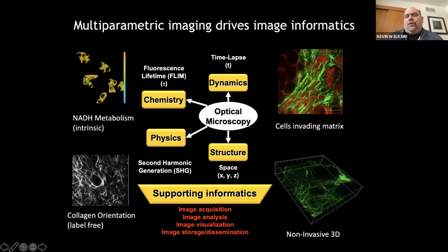As someone who's been building optics for about 25 years now, I've seen the evolution of my lab. It used to be that when we built a microscope, the challenges were often purely physical science and optics, but now a lot of the challenges really are computational. They don't always get highlighted as much as they should. And many of the images we collect, you can't see with your naked eye. And many of you in the room do the same thing.